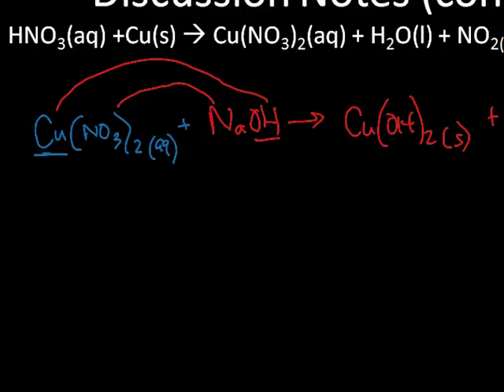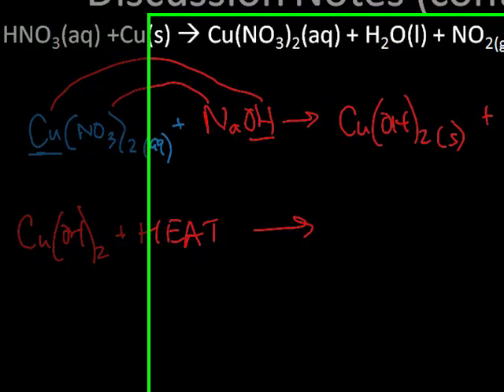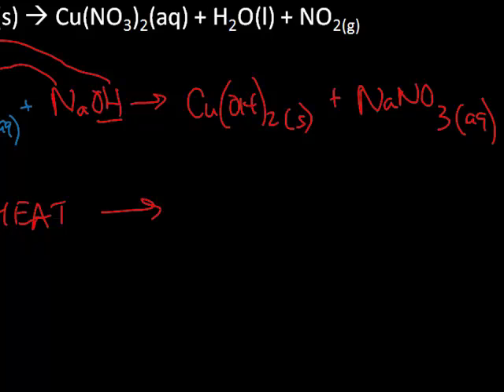Then once we made that copper hydroxide, we heated it up. Now, if you heat up something that has a solution, it's got copper hydroxide, what did you notice coming off of the beaker when you heated it? Some of you may have seen that the substance in the beaker changed color, but there was also some steam coming off. Steam is liquid water that is condensing because the warm gaseous water hits the cold air and condenses into little droplets. The copper hydroxide, when it's heated, you're removing water.